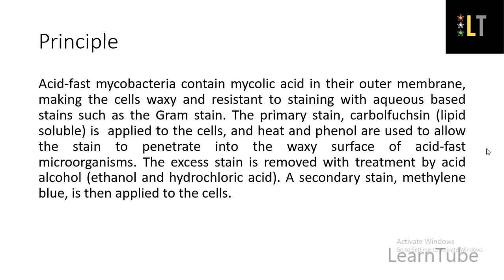So the basic principle involved in acid-fast staining technique is that the acid-fast bacteria, for example mycobacteria or Nocardia, contain mycolic acid as a special component which is present in their outer membrane or cell wall. It is waxy in nature and due to which the normal stains cannot penetrate through the cell wall and hence they cannot be stained by normal staining techniques or Gram staining techniques. They are resistant to staining with aqueous based stains like your Gram stain technique.